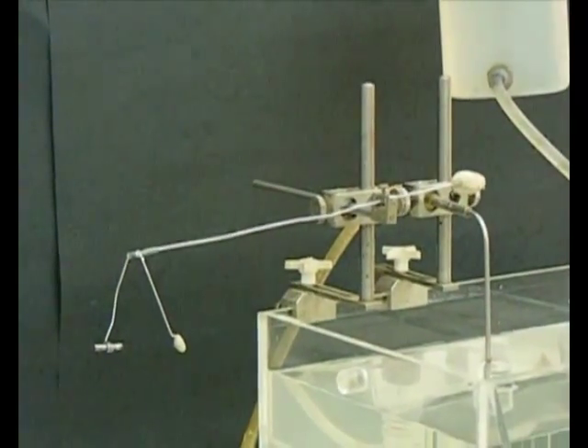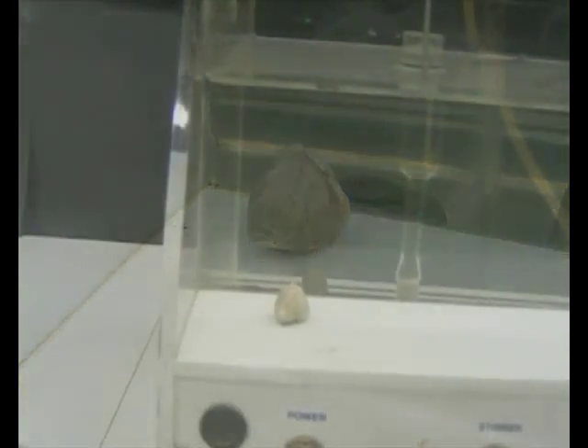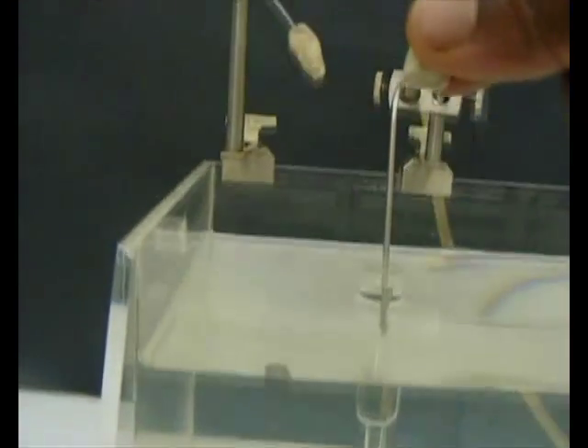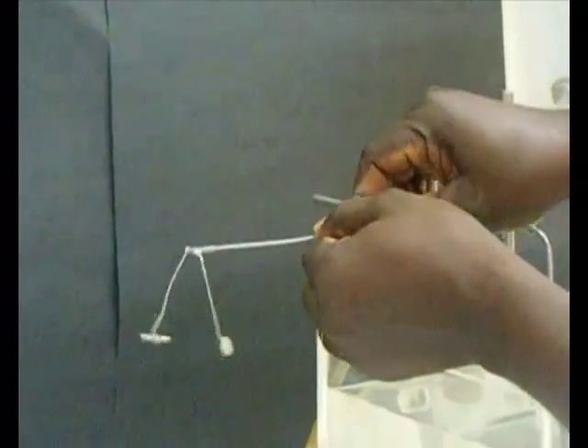After the lever is balanced, a little plasticine is placed on the writing end at approximately the same distance as the balancing plasticine but opposite in direction. The writing lever is then set for recording.